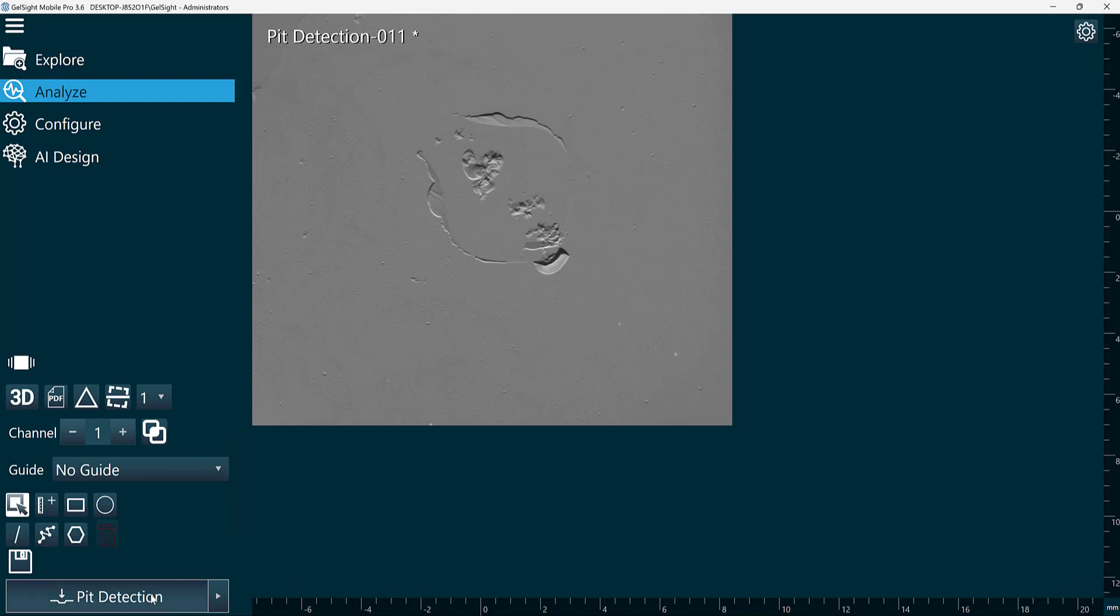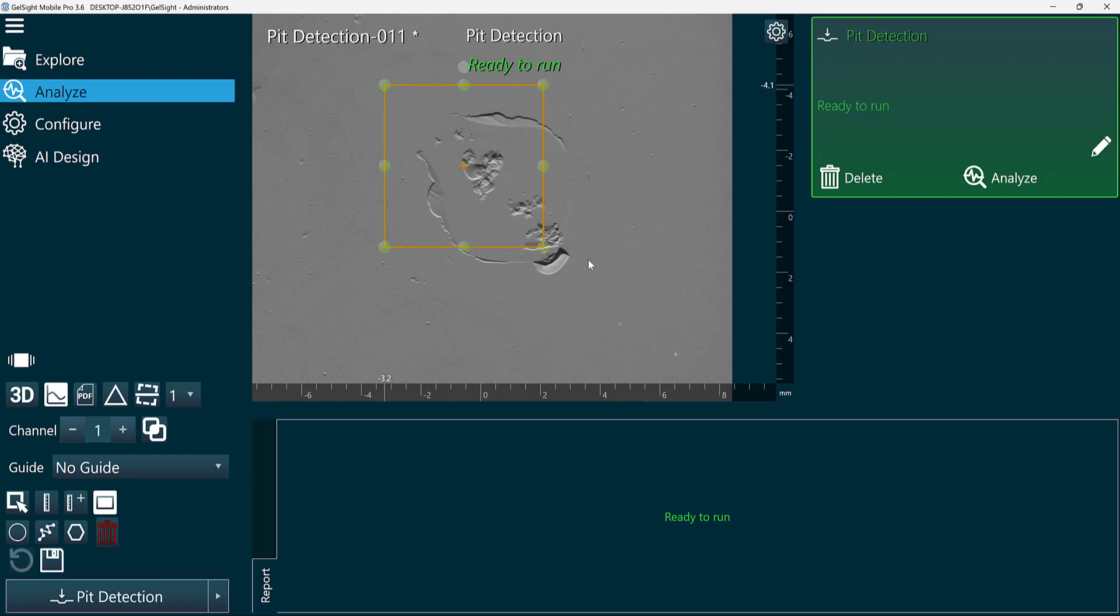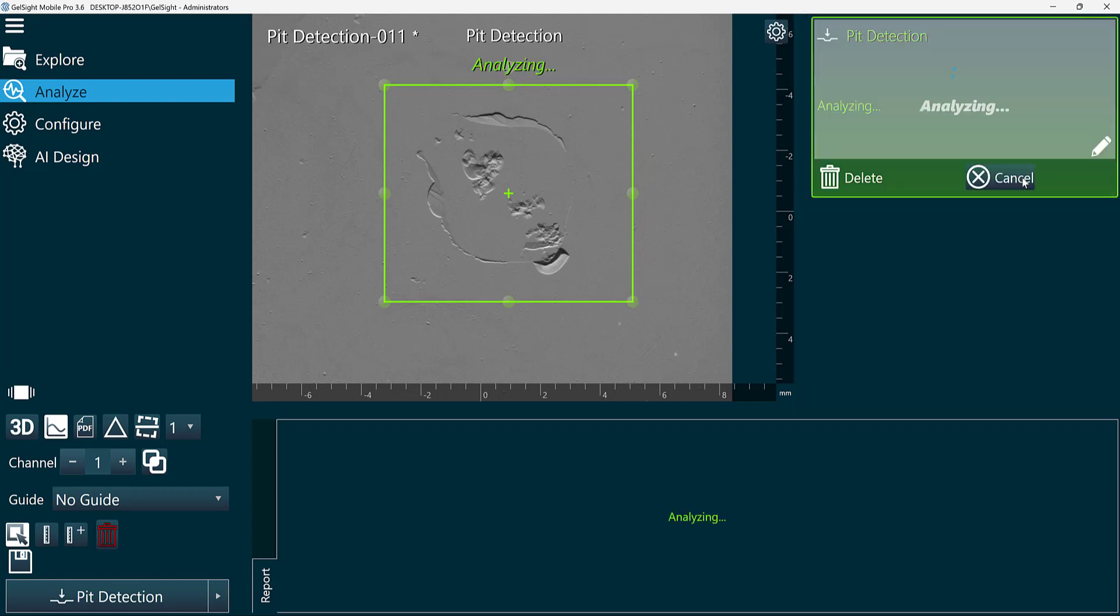First, I'll add our pit detection function. This can run on the full field of view or a region of interest. In this example, I'll define this region of interest and click Analyze.